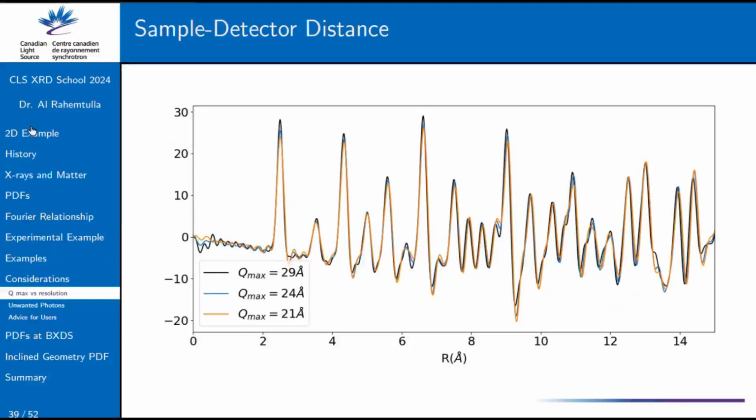But as we get further out in the distance, especially towards this end, we start seeing a point where they match up. And then now suddenly our longer detector distance, where we had better Q resolution, starts getting us sharper long range peaks, because by our detector pixel resolution being better, we're able to better capture the sharpness of some of those Bragg peaks in crystalline materials. And when we do that, that means we're more accurately capturing the long range order of the material. Whereas by going further out into Q, we can better capture the short range ordering. So there's a little bit of a trade-off here.